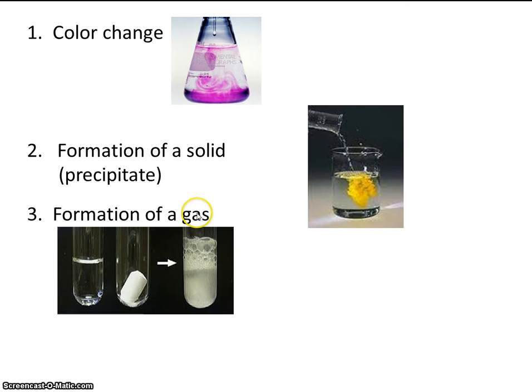Formation of a gas. So here we have some liquid, and then we've added some of this chalky stuff to it, and it's bubbled. So these bubbles are an indication that a reaction has taken place.